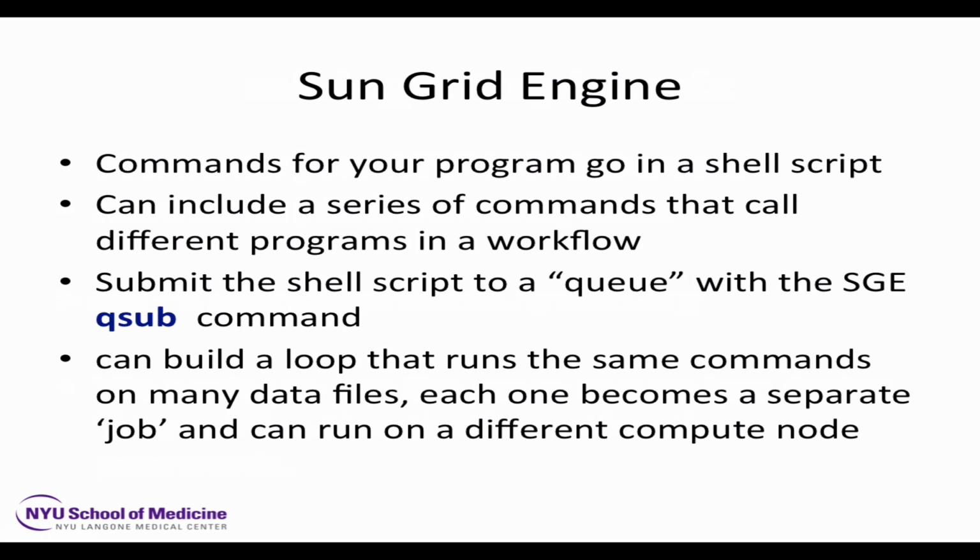All right, we're going to write some SGE scripts today. We're going to start with quality control check, then we're going to do alignment, then we're going to do Cufflinks expression measurement. This is just a fine point.